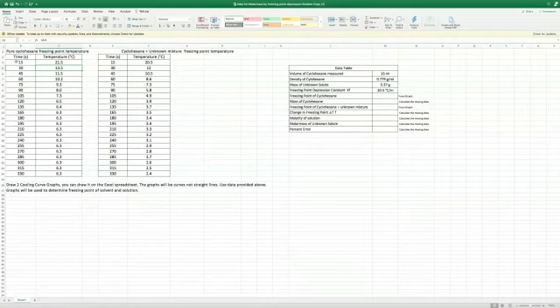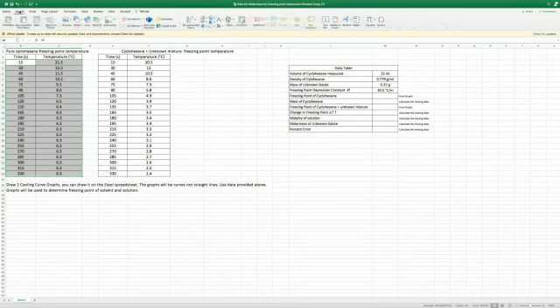So I'm going to start with the solvent only. You want to highlight the numbers. When you're drawing a graph on Excel, you put the x-axis first. So the Excel program assumes the first column you have is the x-axis. The second one is the y-axis. So if you do it this way, then you go to Insert. So I've highlighted this, right? Go to Insert. And by the way, if you know how to do what I'm struggling to do, you can always help me out. I'm always open to learning.